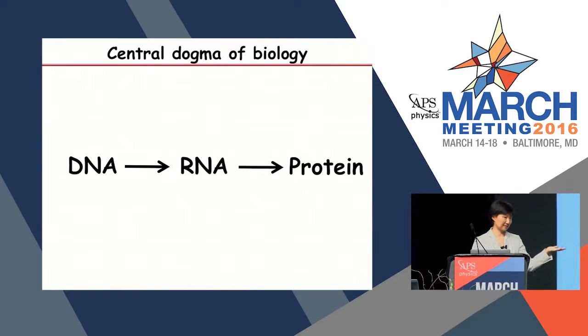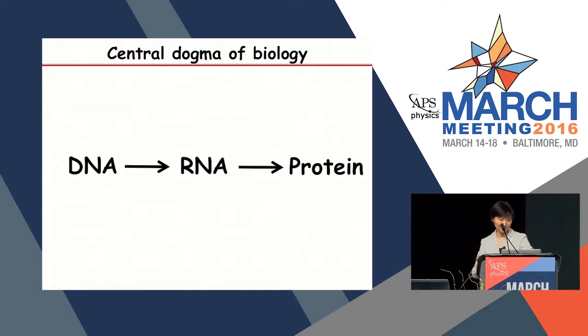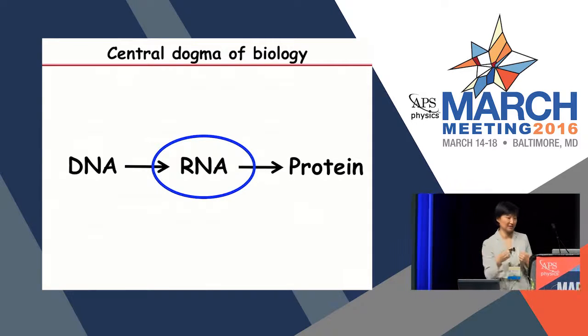And we're obviously thinking along the line of DNA, if you hear about the talk tomorrow. But between RNA and protein, we pick RNA. And that's not because proteins aren't important. They're absolutely important. It's just because, as I confess, RNA is an easier thing where you can imagine how to label them all simultaneously.